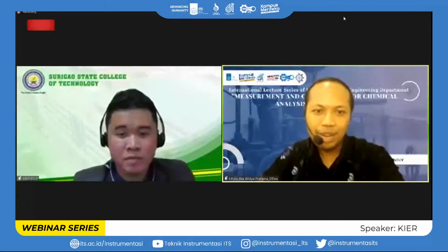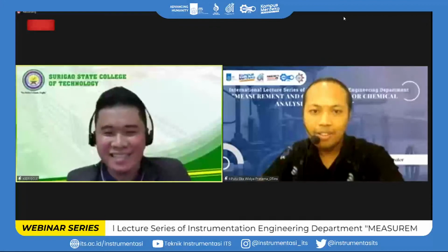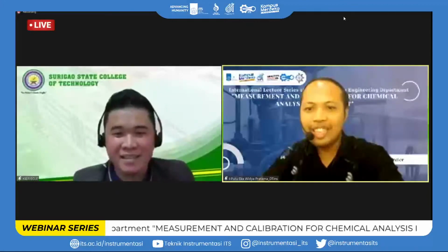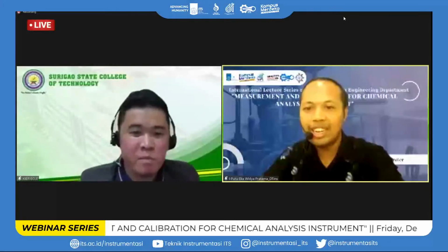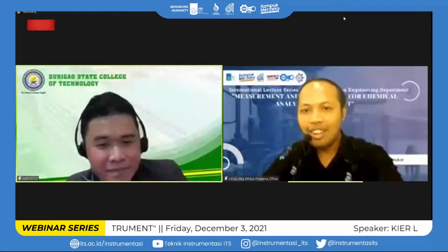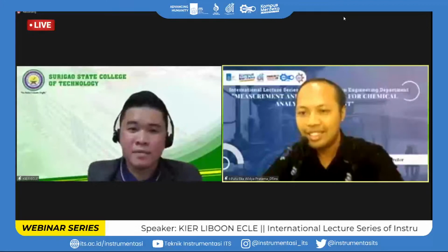In the first one, can we use it to analyze hydrocarbon composition? Yes, sir, we can. Is there any limitation on what properties we can analyze?